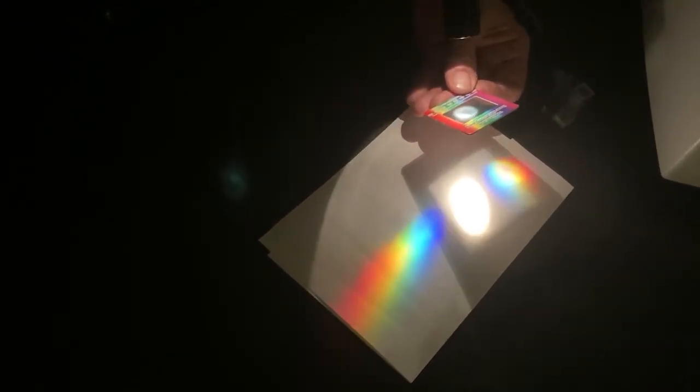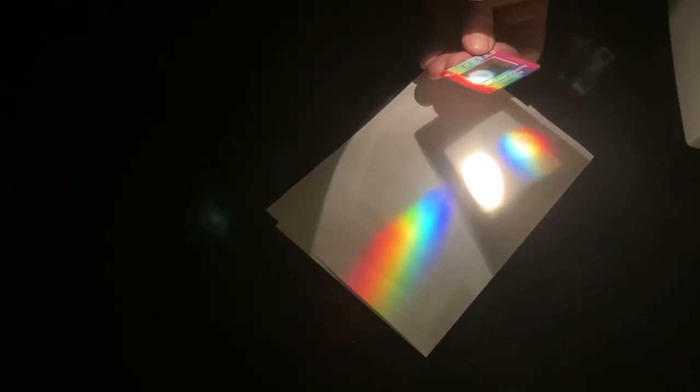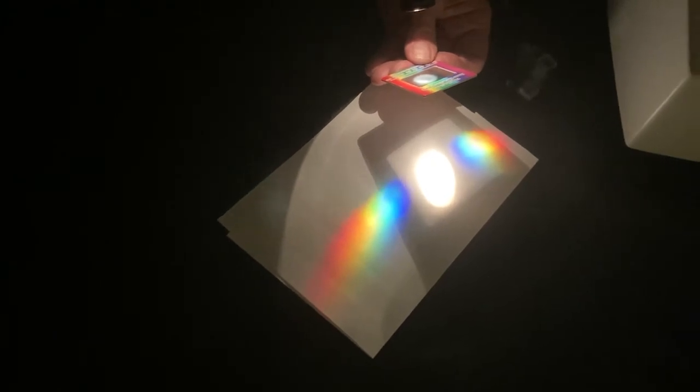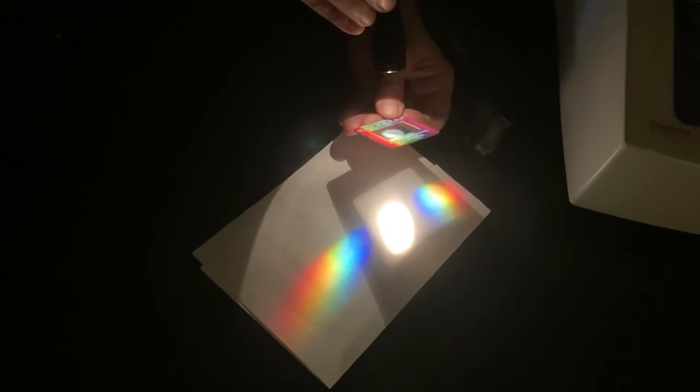Now, I don't know if we really see indigo, violet, but it does make a convenient mnemonic, an easy way to remember the colors. So, shall we go with that? I think that's a good one. All right. Let's turn the lights back on.